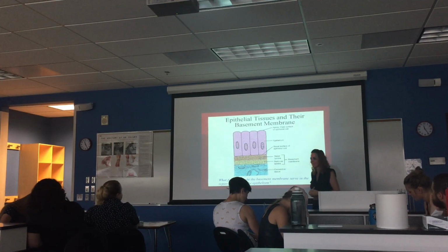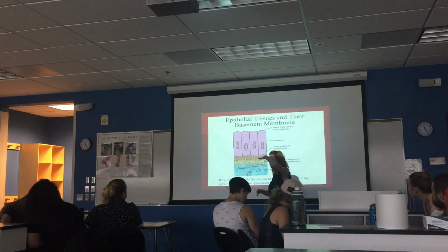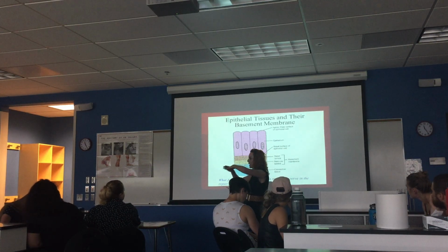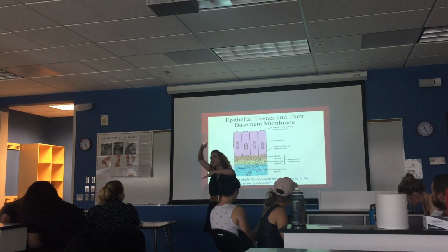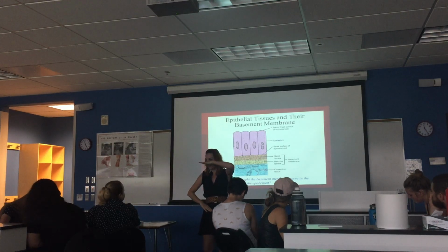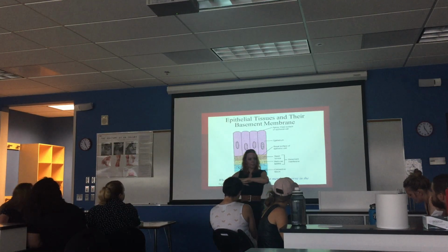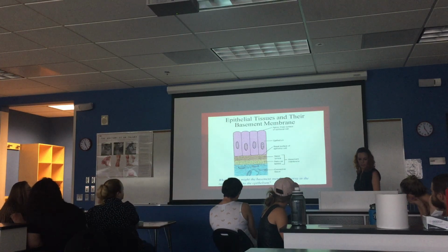And so forth. In the little ones inside the blood vessel, the simple squamous inside the blood vessel, the endothelial lining, there's an exposed part of the cell, the one that's in contact with all the platelets and red blood cells and white blood cells, and then there's the part of the cell that's attached to the connective tissue that's attaching it to its smooth muscle.